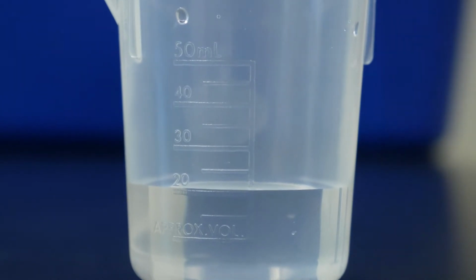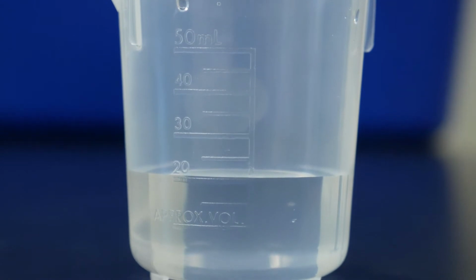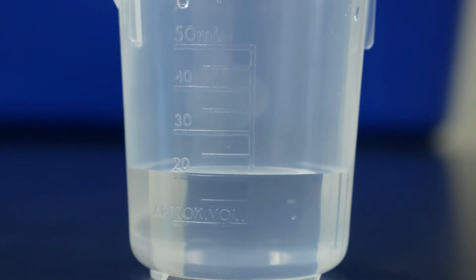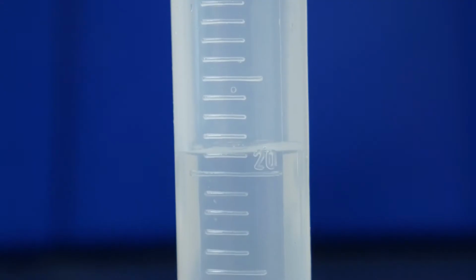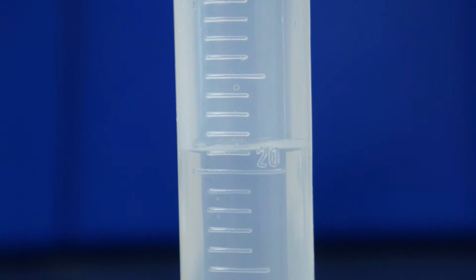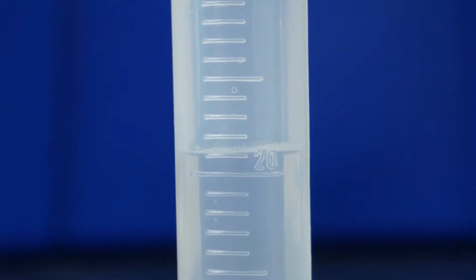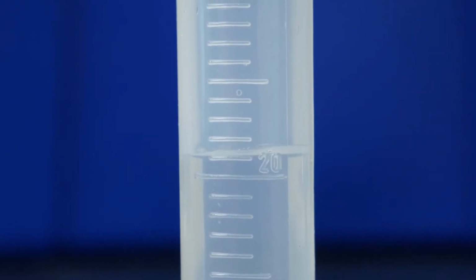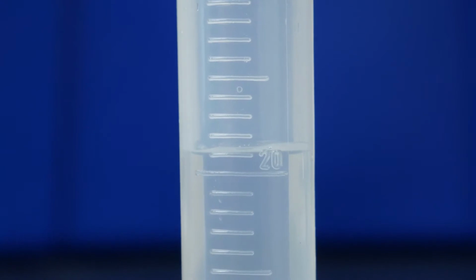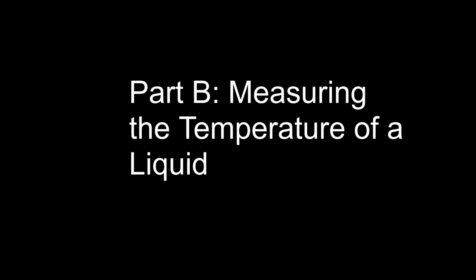All right, so this is now the second part. We are filling this beaker up to only a quarter full. We're going to put it in a graduated cylinder, and we're going to measure how much the volume is up to 0.1 milliliters. All right, so we've now taken that 1/4 filled beaker, we've put it in a graduated cylinder. So again, on your data table, I'd like you to write down how much volume of water is in here to the closest 0.1 milliliters. So it looks like it might be between about 21 and 22.